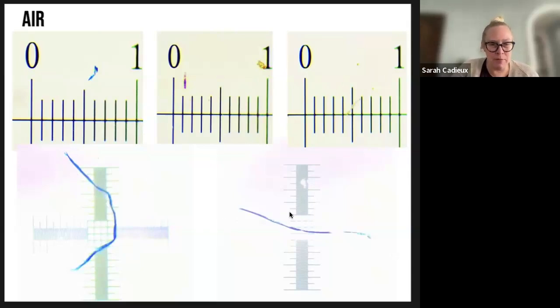Some big blue fibers as well. Pretty sure all these blue fibers are from jeans. We tried to have everyone wear cotton as opposed to synthetic materials. So many of these may not actually be plastics, but they are anthropogenic fibers.